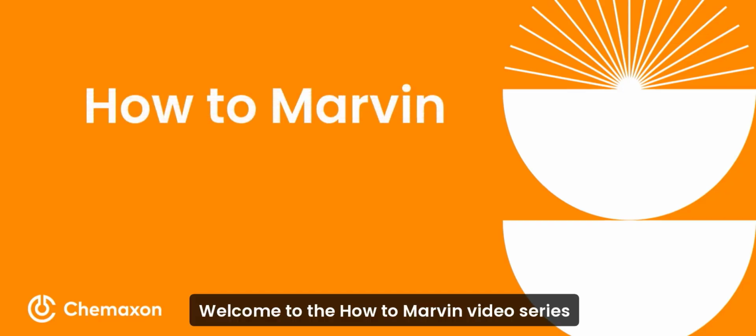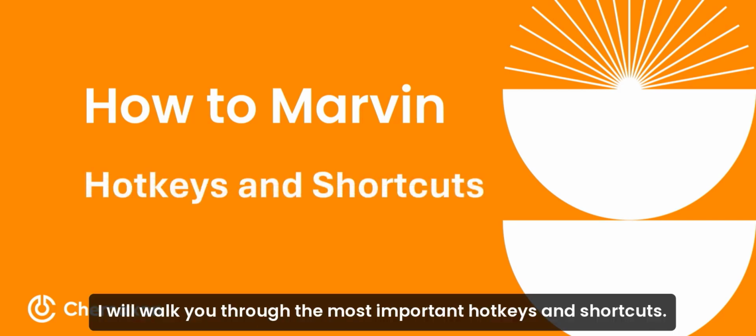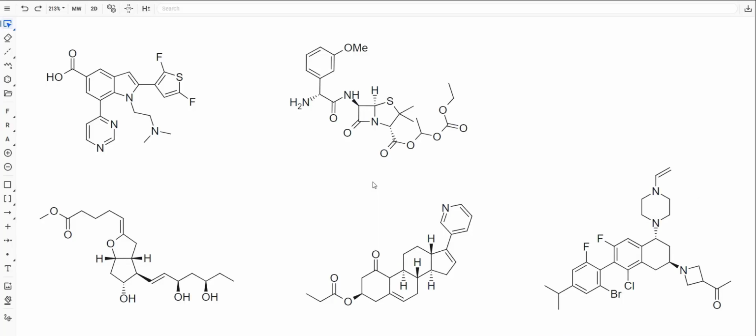Welcome to the How to Marvin video series. In this video, I will walk you through the most important hotkeys and shortcuts.